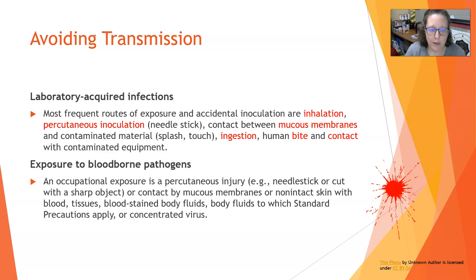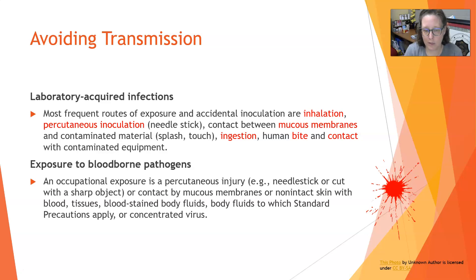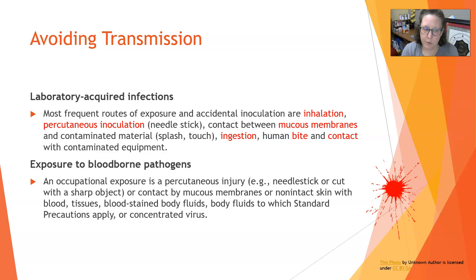An occupational exposure to a blood-borne pathogen is either a percutaneous injury — a needle stick or cut with a sharp object — or contact by the mucous membranes or non-intact skin, such as broken skin with a wound, with blood, tissues, blood-stained body fluids, body fluids to which standard precautions apply, or concentrated virus. That is what exposure to a blood-borne pathogen means.